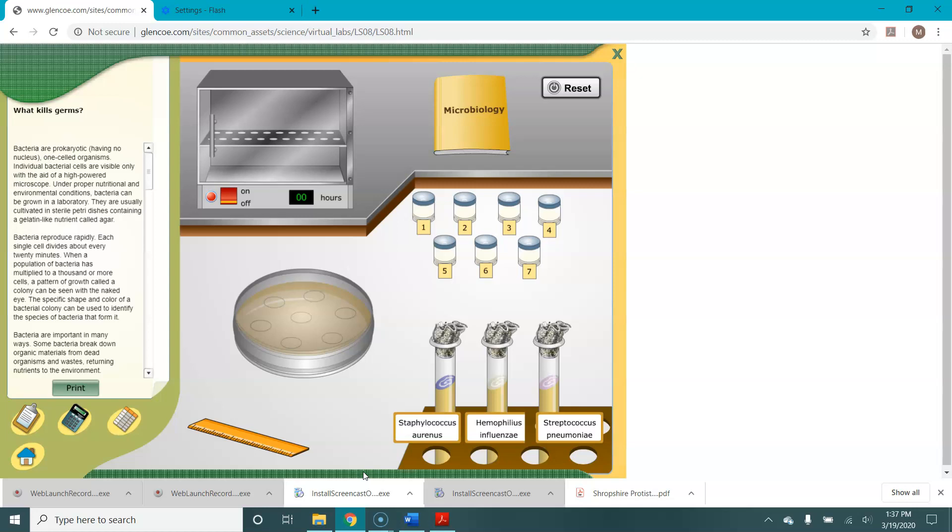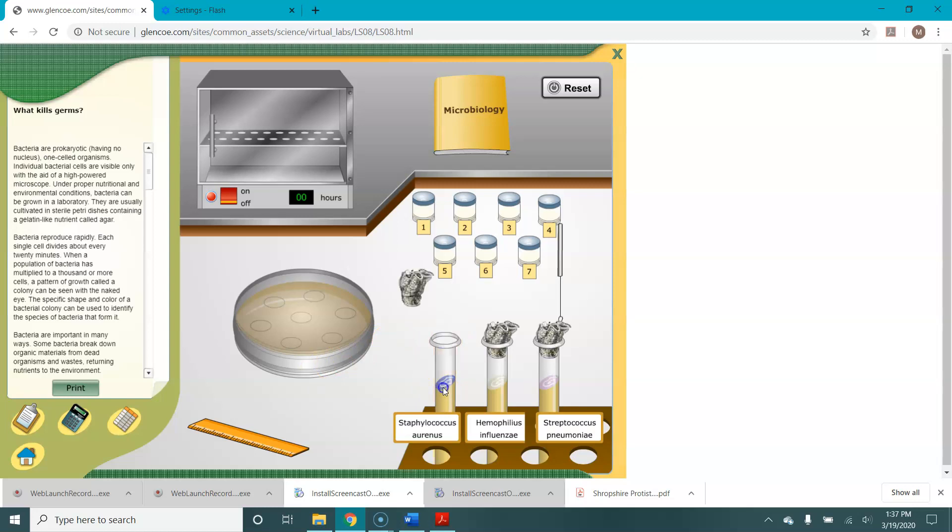So you'll notice in your lab directions the first thing you need to do is create a lawn of bacteria. You're going to do this right here. This is called an agar plate when it is full of that jello-y stuff called agar and we need to create a lawn on it. So we're going to click on one of these bacteria. Let's start with Staph aureus.